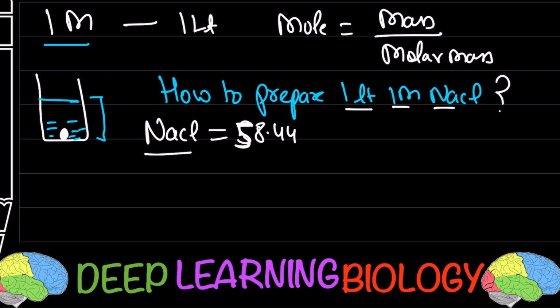Keep in mind, if you weigh 58.44 gram, then how many moles are present in 58.44 gram NaCl?